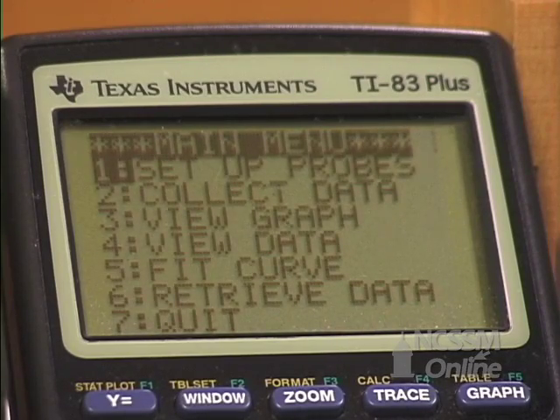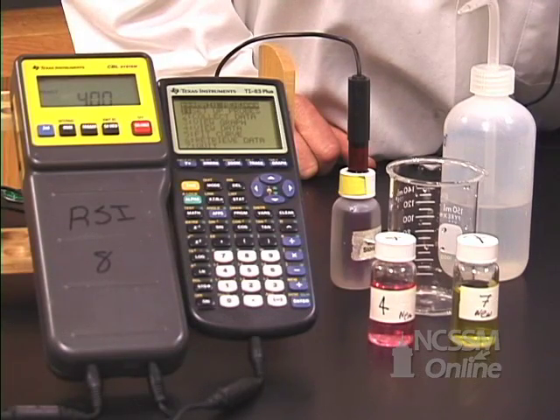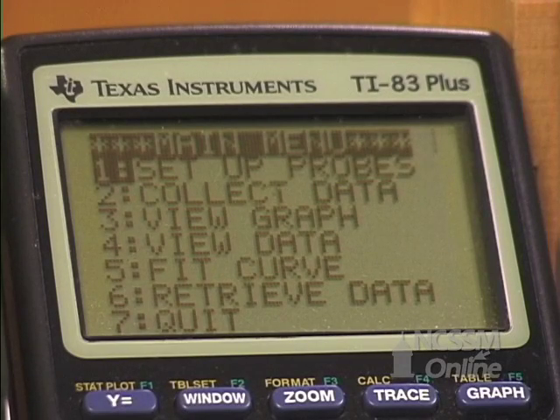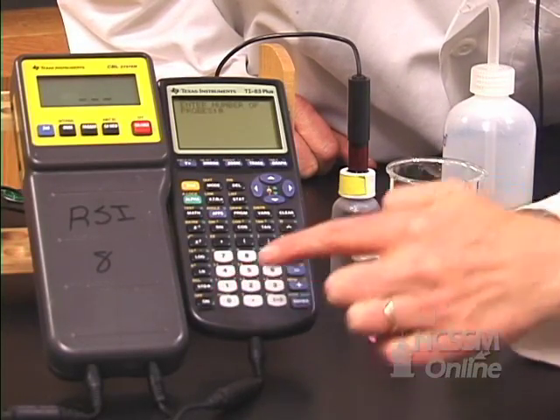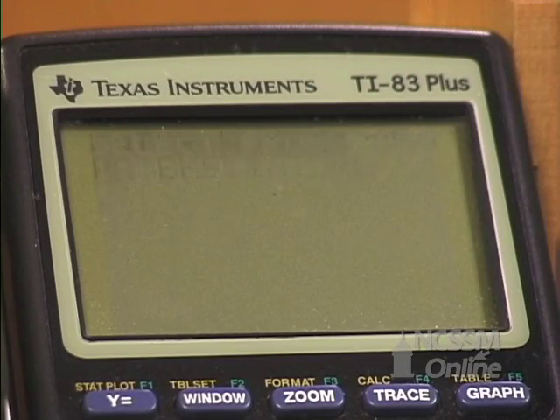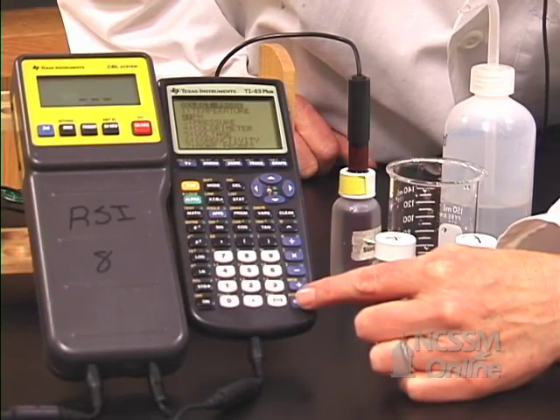Now you have a menu that says 'Set Up Probes.' We're going to tell the CBL and the calculator what probe we have plugged in. Press enter to set up probes. It asks how many probes we're using — we're using one, so press 1 and enter. Then it asks what kind of probe, and we're using a pH probe, so select pH probe.